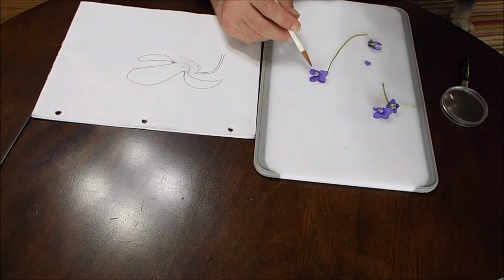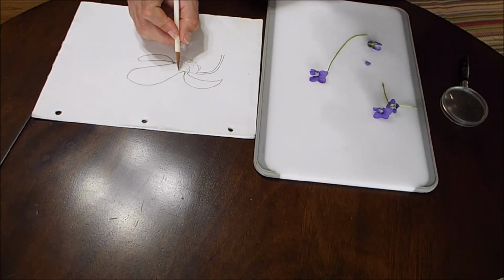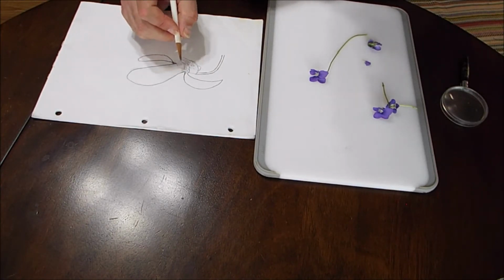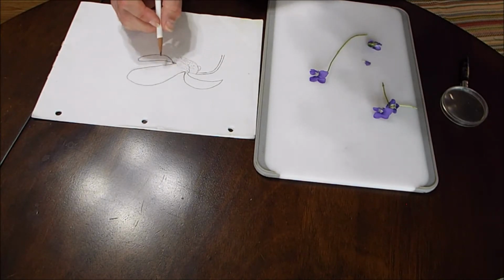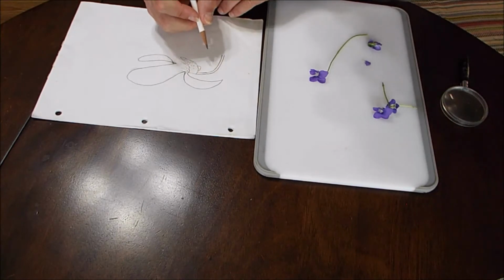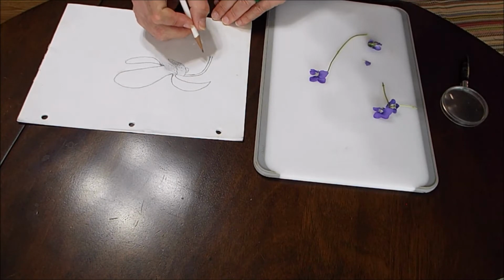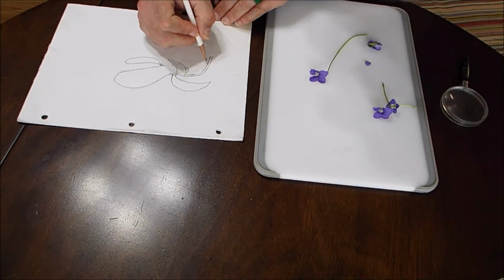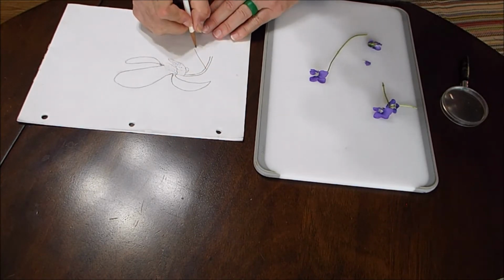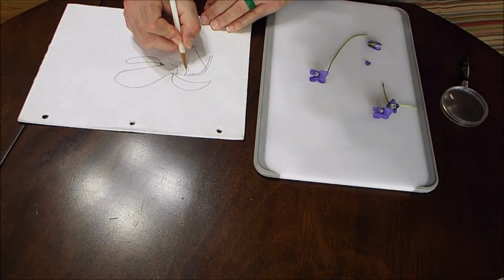If I wanted to get fancy, I could draw some contrast here with the outer portion of the petals being dark, but I don't think I'm going to do that. All right, now I'm going to label. So labeling is very simple. You draw a single line to the object, right, with no arrow or anything. So this is going to be stem of the flower, right? I didn't darken that in, did I?